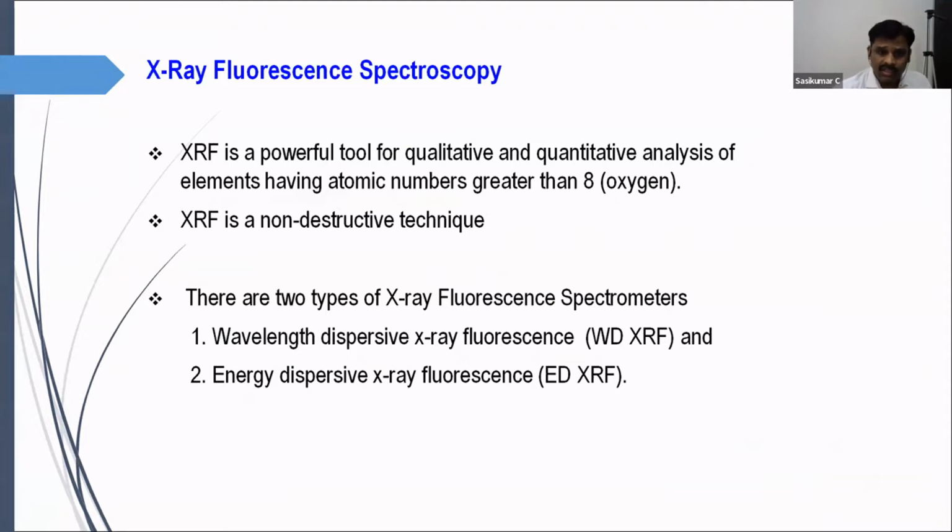In fact, there are two varieties of XRF available with us. One is WD XRF, which we call wavelength dispersive XRF, and the other is energy dispersive XRF. What is the difference between WD XRF and ED XRF? ED XRF works based on the energy dispersive principle, and most of the elements you can analyze.